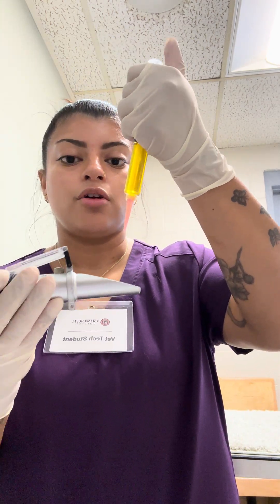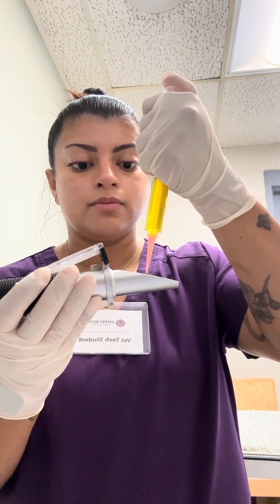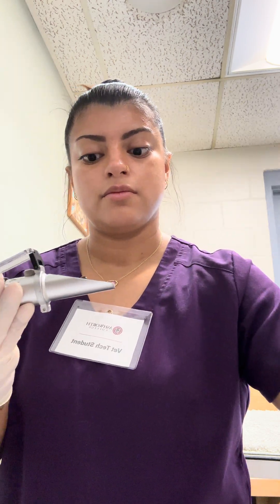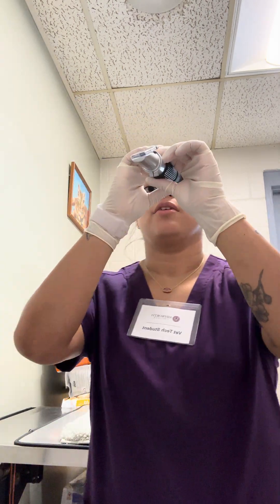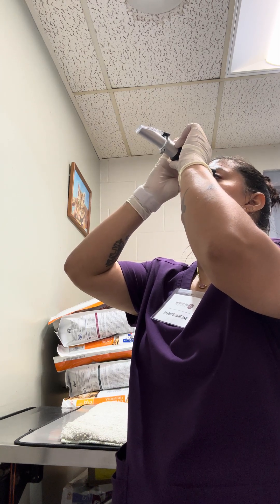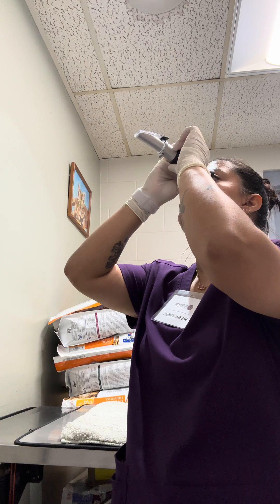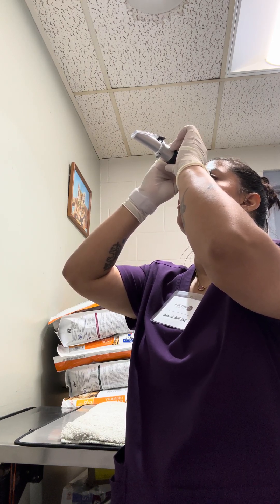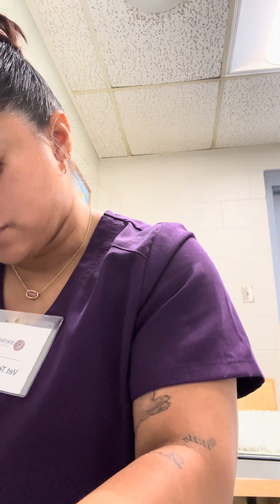Now I'm going to place one drop onto my refractometer. Let's put it up to the light. This is saying above 150 — greater than 150.